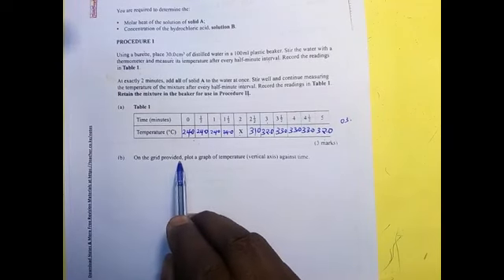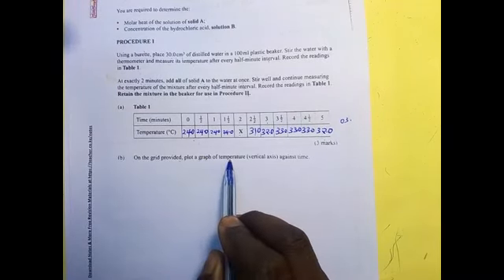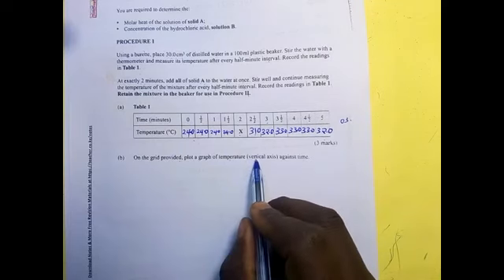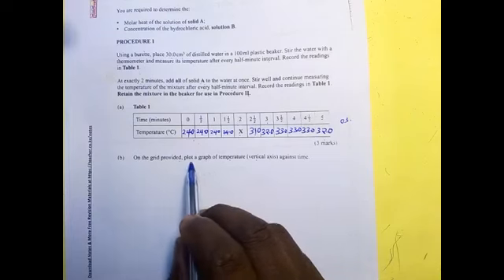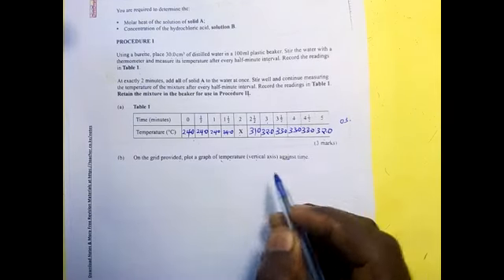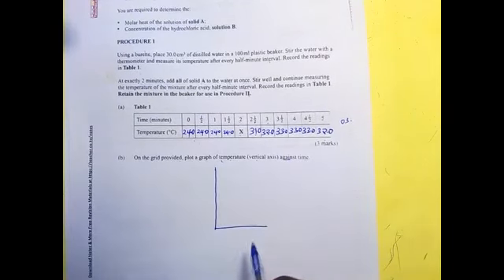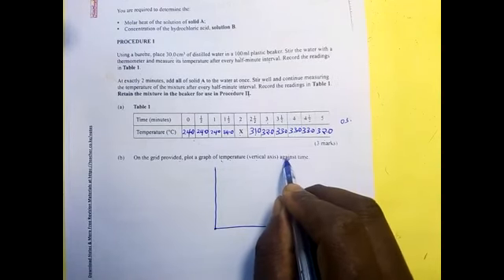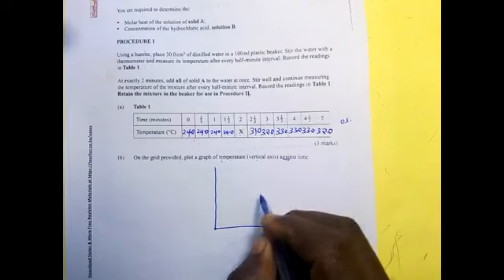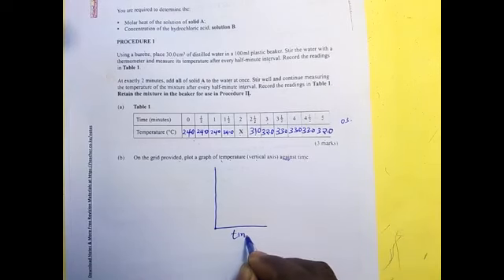On the grid provided, plot a graph of temperature, vertical axis, against time. When you are told to plot a graph of temperature against time, the one which comes after the word against is always the x-axis.